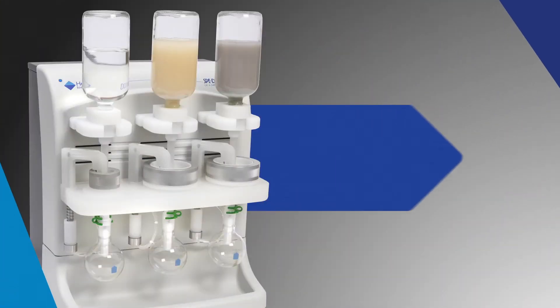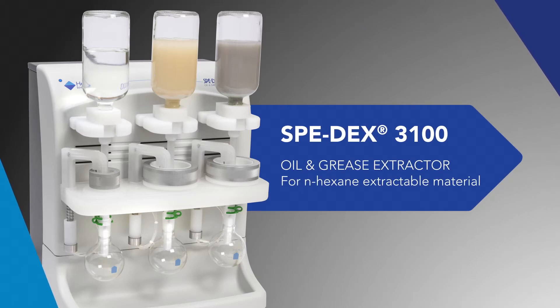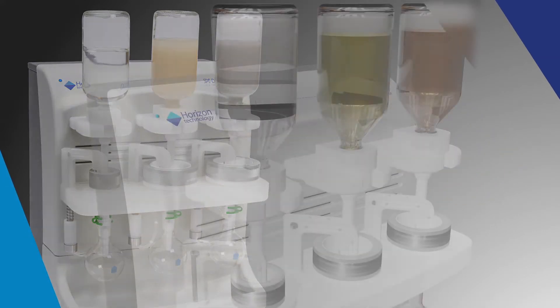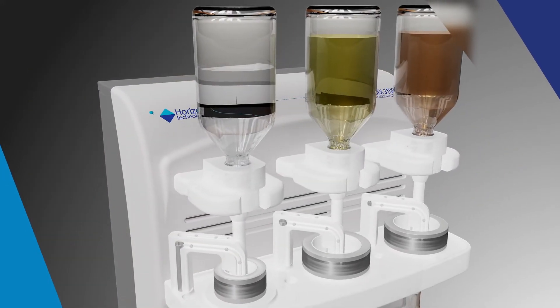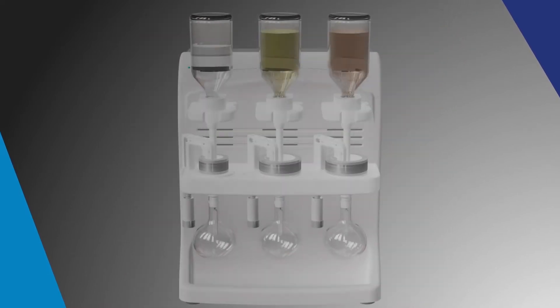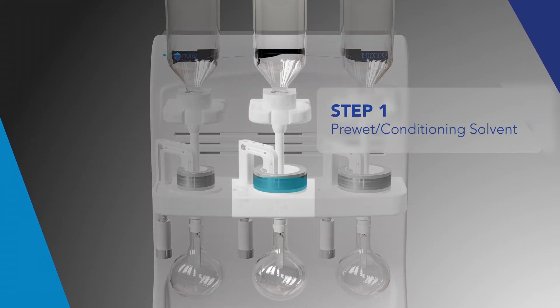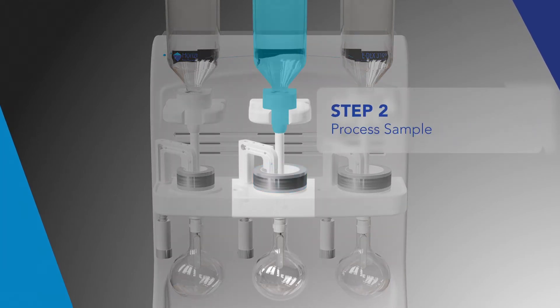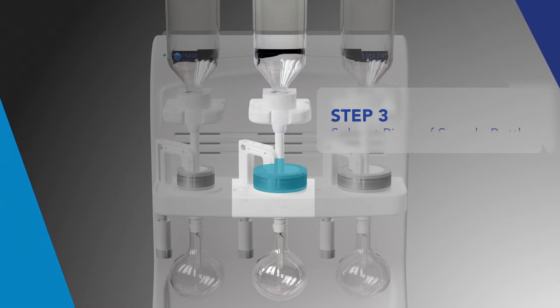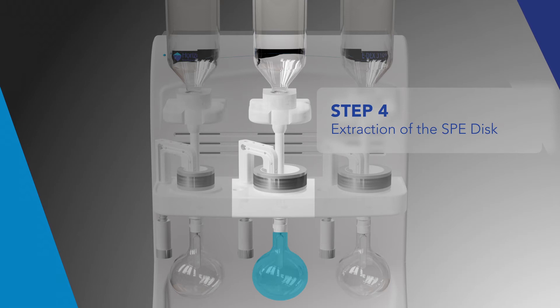The Horizon Technology SpeedX 3100 Oil & Grease Extractor is a modern automated disc SPE system. The system automates the entire extraction process and is fully compliant with regulatory methods. The system operation is shown in steps 1 through 4: preparing the disc, processing the sample, rinsing the sample bottle, and elution of the sample.